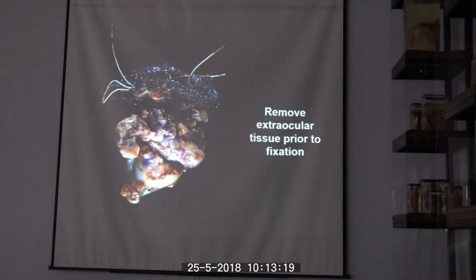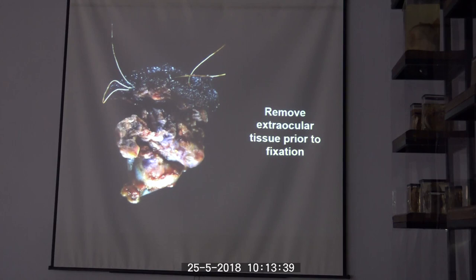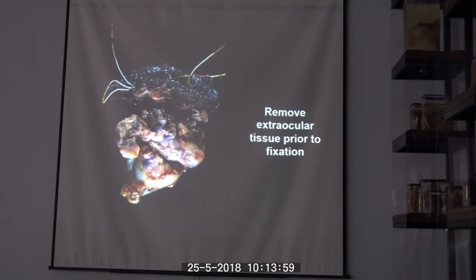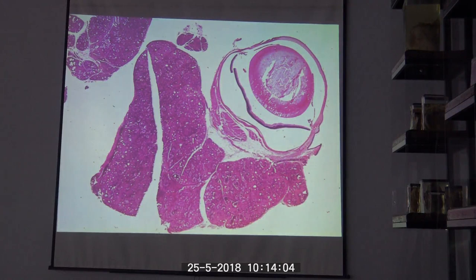Either we have a sample collected on the necropsy floor or from a live animal. This enucleation specimen has sutures keeping the eyelids closed. Unfortunately, that is often the way samples are submitted. The best approach would be, after collecting the sample, to remove all extraocular tissues. The more tissue you leave with the globe, the more likely you are to get artifacts like retinal detachment.